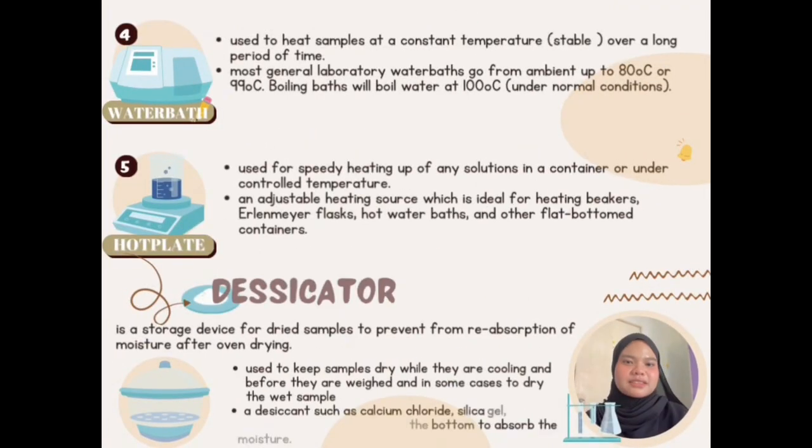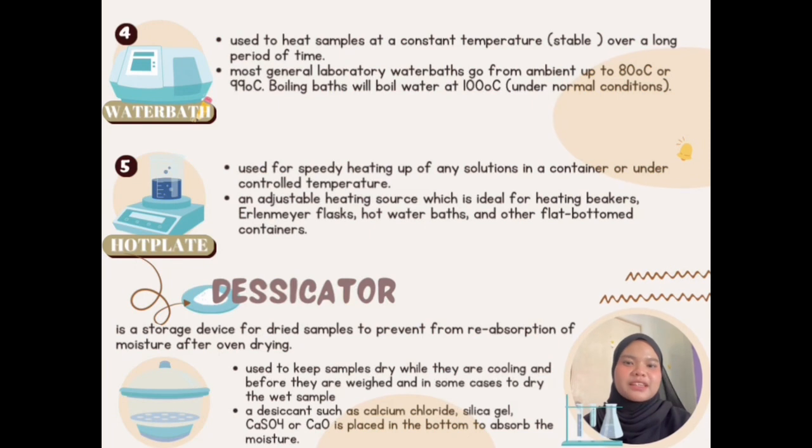Next is the water bath. It is used to heat a sample at a constant temperature which is stable over a long period of time. Most general laboratory water baths go from ambient up to 80 degrees Celsius or 99 degrees Celsius. Boiling baths will boil water at 100 degrees Celsius, which is under normal conditions. Lastly, the heating apparatus is the hot plate.